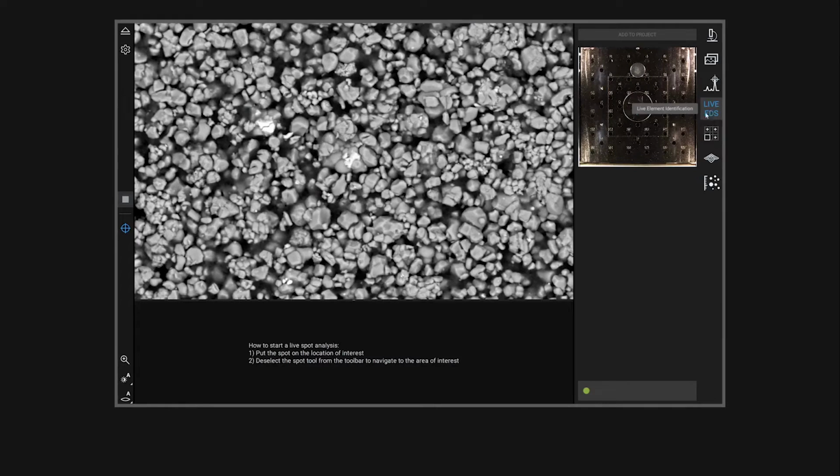In industrial manufacturing, a typical way to measure the contamination of a sample is by counting the type of contaminants that you have in your material. EDS allows you not just to count them, but also to get their chemical composition to understand where they come from.